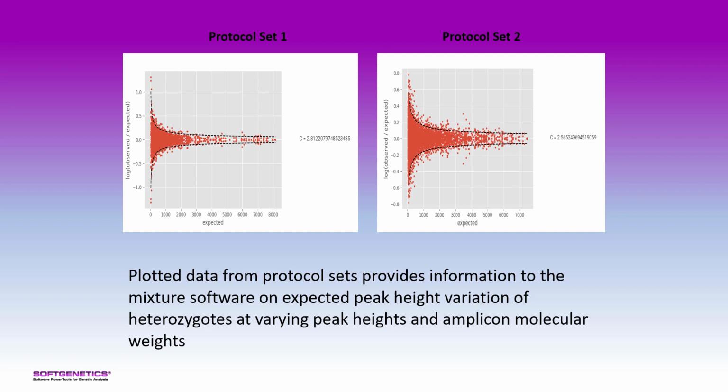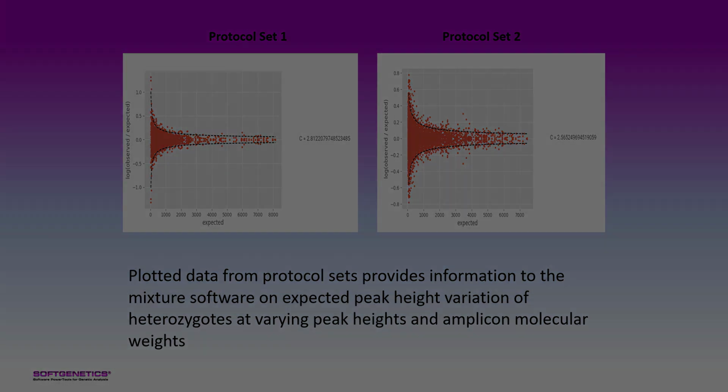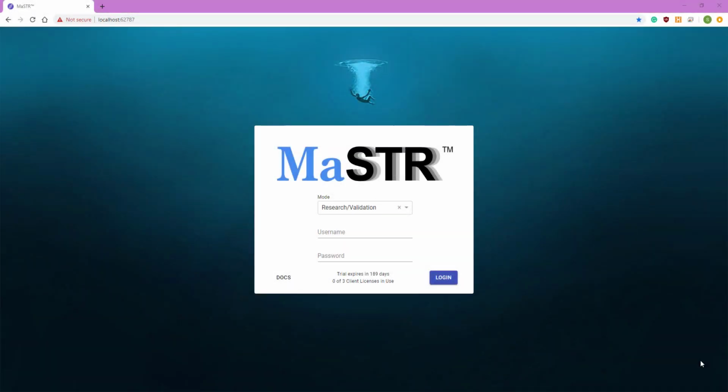Now I will demonstrate the necessary steps to prepare MaSTR to analyze your lab's mixture samples. This is the login screen. Prior to setting up MaSTR, the administrator will need to set up user management so that everyone using MaSTR has the necessary permissions to access the areas needed for their duties.